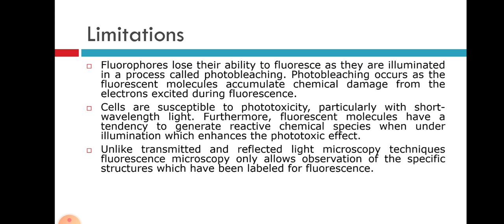Furthermore, fluorescent molecules have a tendency to generate reactive chemical species when under illumination, which enhances the phototoxic effect. Unlike transmitted and reflected light microscopic techniques, fluorescence microscopy only allows observation of specific structures which have been labeled for fluorescence.